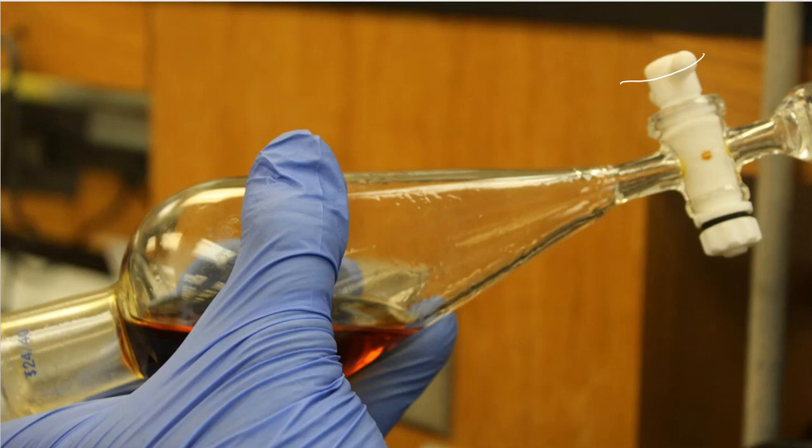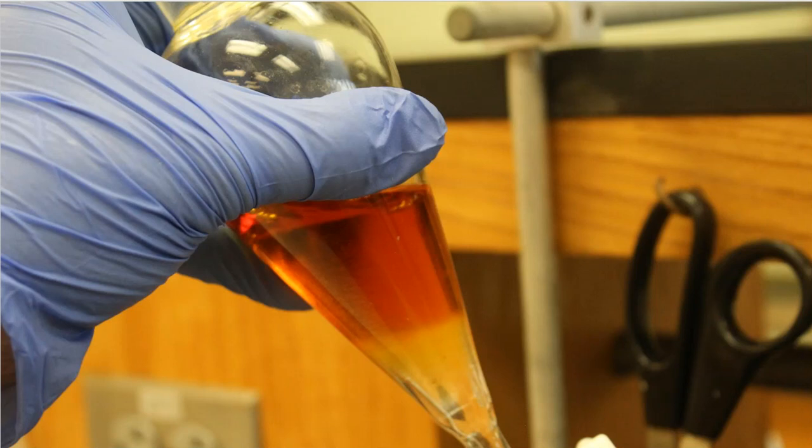All right, with that said, I turned the separatory funnel back over and I'm just going to allow this to kind of separate out, give it some time, be patient. Practice makes perfect, but patience leads to perfection as well. So you just got to let it sit out, do its thing, and then come back to it when you're ready to separate a few minutes later.